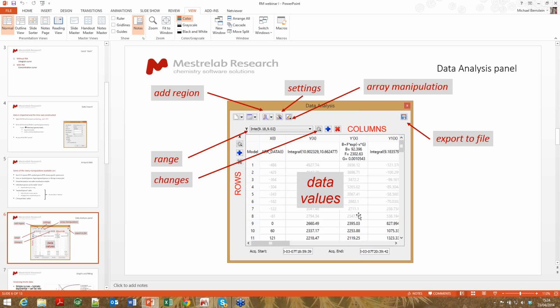And in the y prime column next to it, you'll see the fitted numbers, which are there as a consequence of having done the 3-parameter exponential fit. And then the next region is called y1, and it's got a y1 prime column associated with it, and so on and so forth. So this is the second region, third region, and it goes on as long as you'd like it to. And I'll show you this in more detail. So let me start telling you what I will show you and just do it.